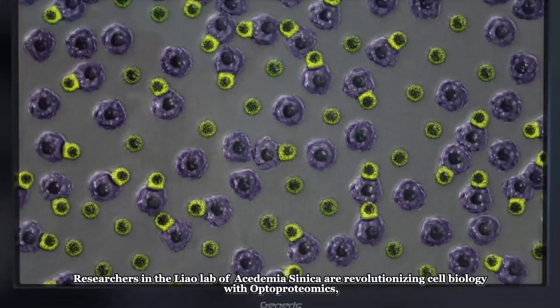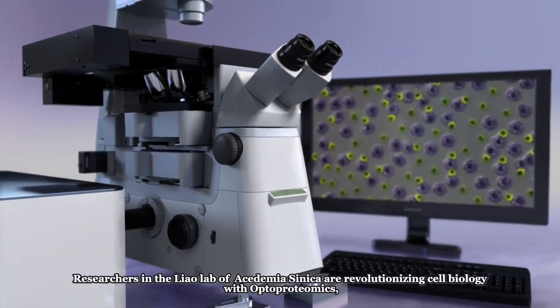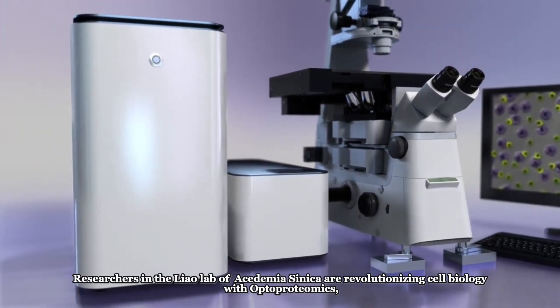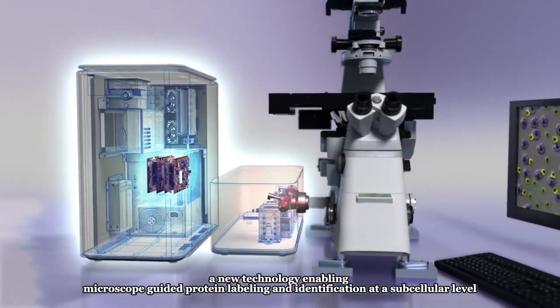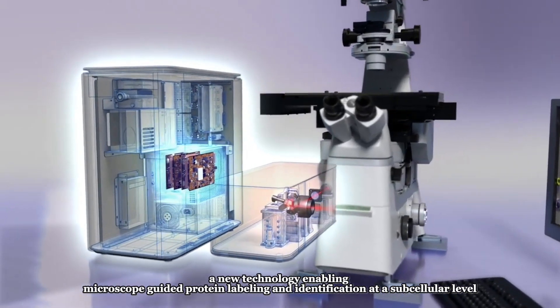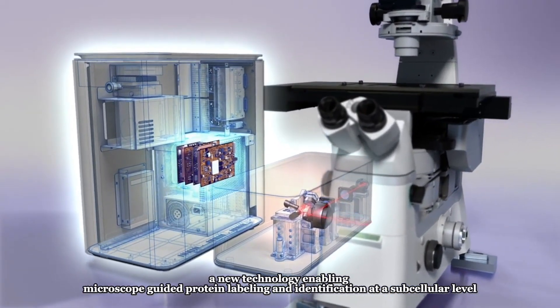Researchers in the Liao Lab of Academia Sinica are revolutionizing cell biology with optoproteomics, a new technology enabling microscope-guided protein labeling and identification at a subcellular level.